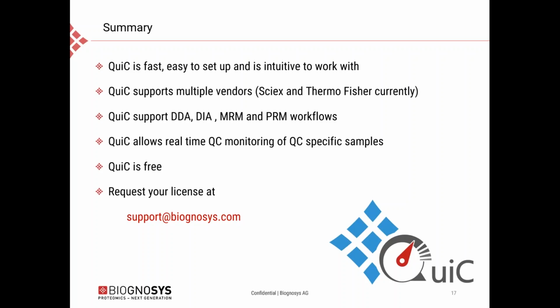But as Lucas mentioned, the user has the freedom to change this library in the settings perspective to any other library they want to use. This can easily be done by generating a spectral library in Spectronaut, or if you don't have a copy of Spectronaut on your computer, you can also contact us at support@biognosys.com and we can provide you with such a background library.